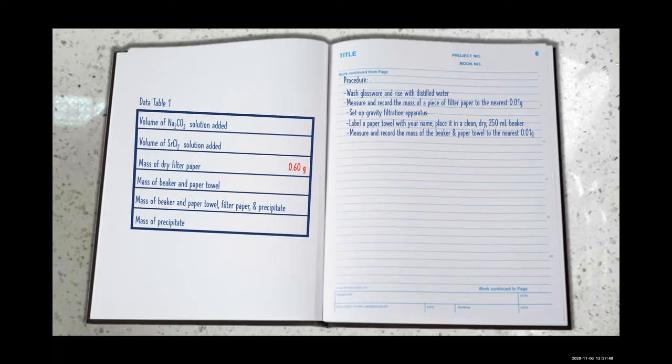We will measure and record the mass of the beaker and paper towel to the nearest 0.01 gram.